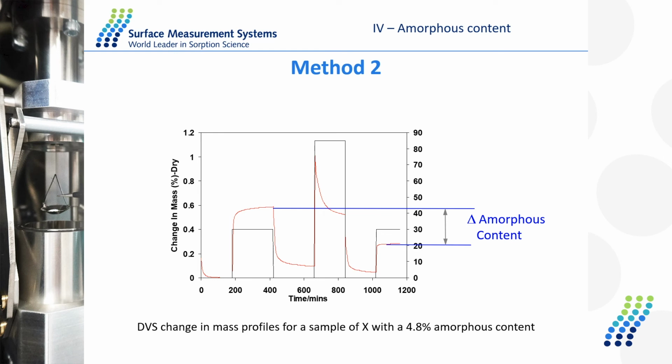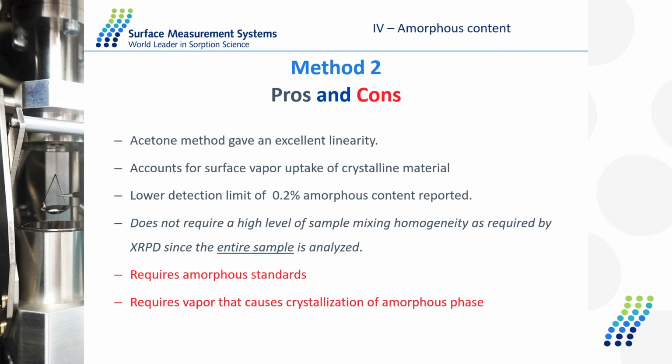So what are the advantages of this method? This method is very well recognized, is reported in the pharmacopoeia, and is extremely reliable. It is accurate up to 0.2%. It does not require a calibration process. It does not require a calibration curve because you just have to define a standard of amorphous. It's very reliable, much more reliable than powder XRD.